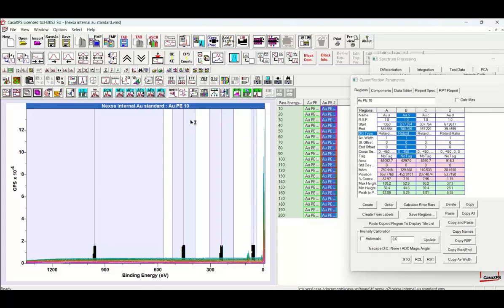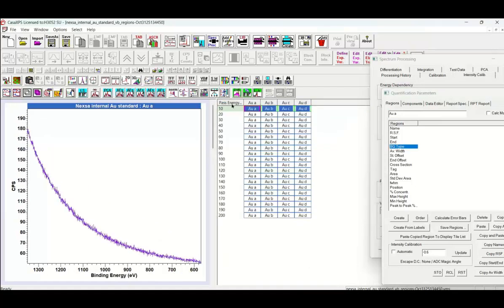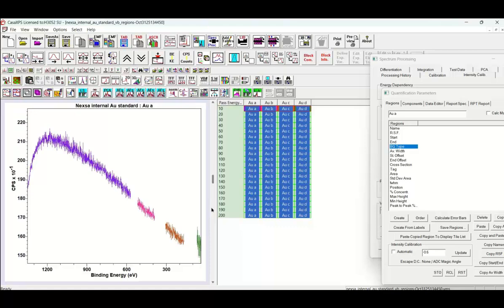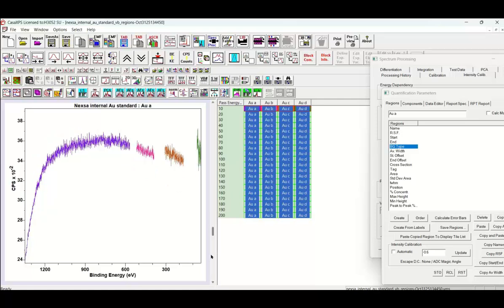The next step is to extract from these data these regions, so I can then construct a set of VAMAS blocks that I can then fit with the closed form that will approximate these transmission functions. So let's do that. I've overlaid, and I can use now the spectrum from regions option that will extract from these spectra a set of regions. So there they are. I've now got a set of regions, and you can see here, now I go down the scroll list, you can see how I've pulled out bits of background that are relevant to the transmission and avoid, for the most part, peaks.